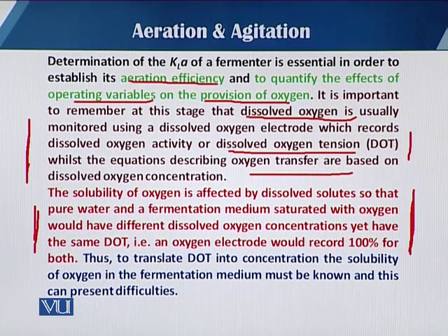So simply, the oxygen electrode records as a percentage, where we take the maximum as 100%. So for the DOT in concentration, the solubility of the oxygen in the fermentation medium must be known, and this can present different difficulties.